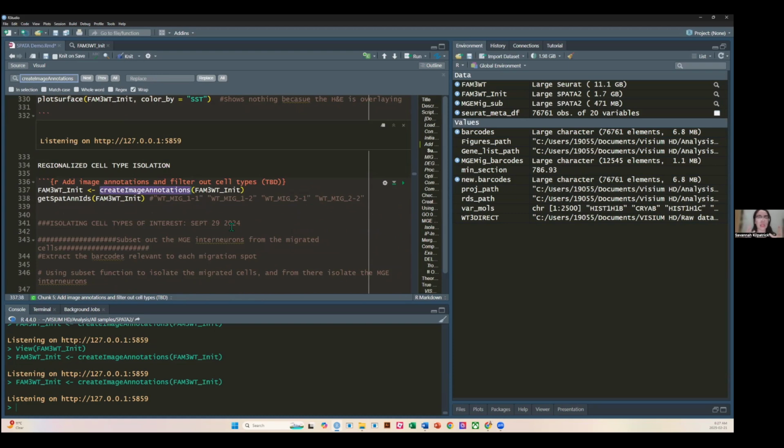But yeah, essentially what you can do is either load in your raw data entirely. There is an asSPATA2 function that theoretically can change a Seurat object directly to a SPATA2 object. But again, it's a little finicky. But yeah, that's the kind of gist of the script.